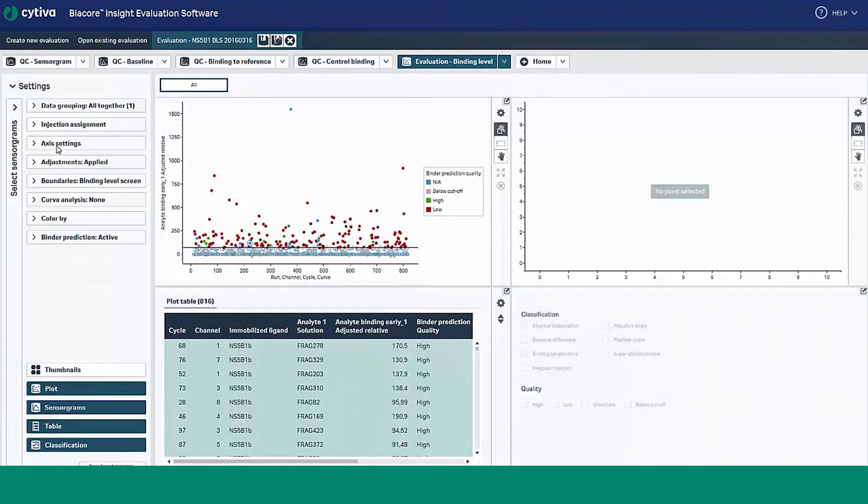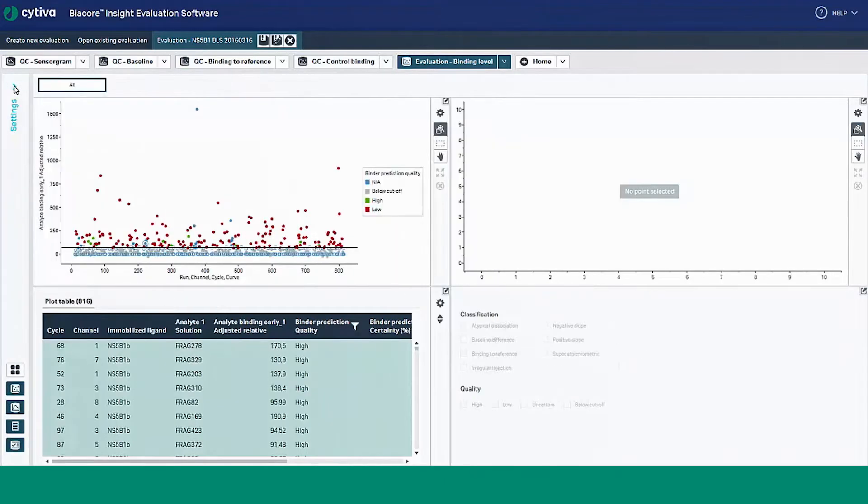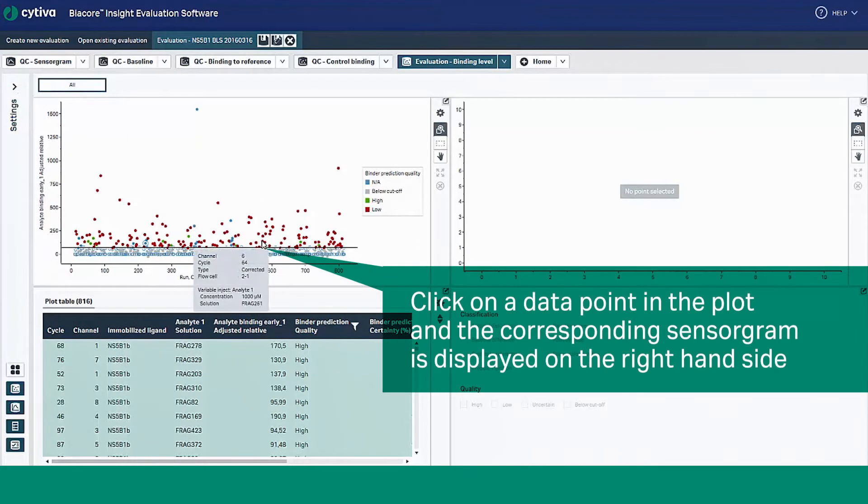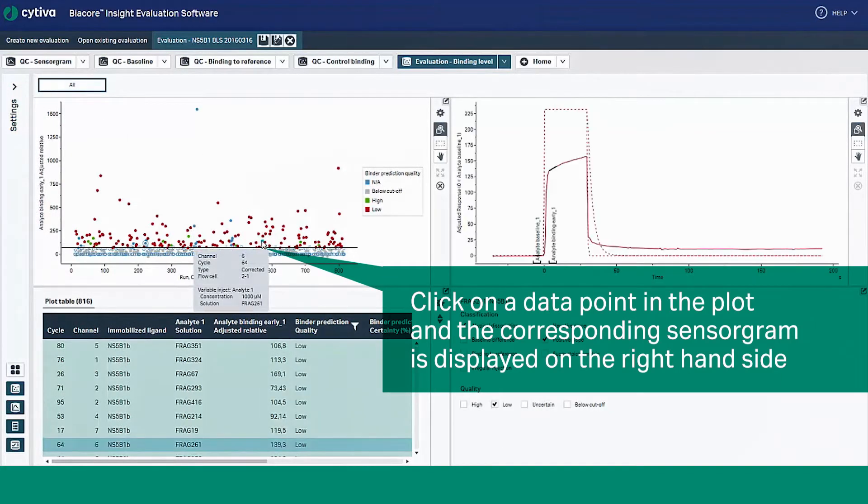Let's go ahead and minimize the left-hand pane for now. Click on a data point in the plot to display the corresponding sensorgrams on the right-hand side.